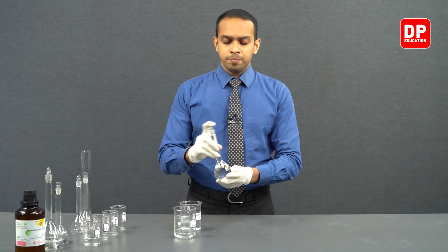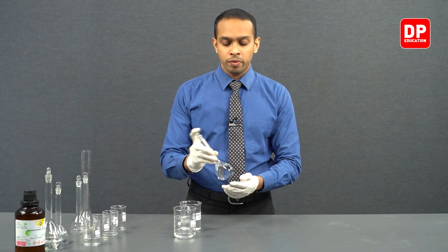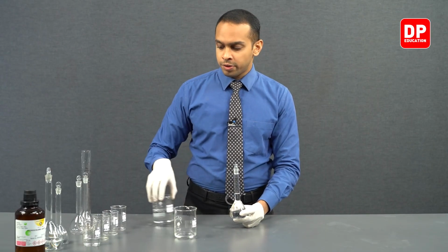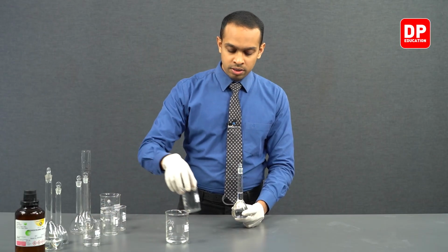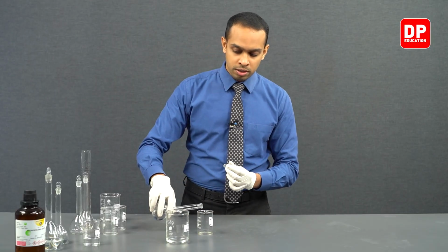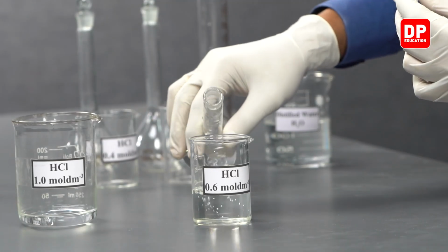After adding the right amount of water, we can always turn it upside down to make a more homogeneous solution. Afterwards, students, we can now transfer a small portion of this solution into this beaker that is labeled 0.6 moles per decimeter cubed.